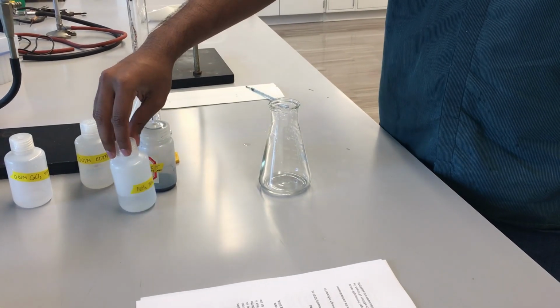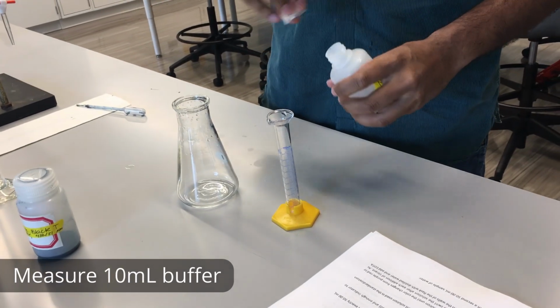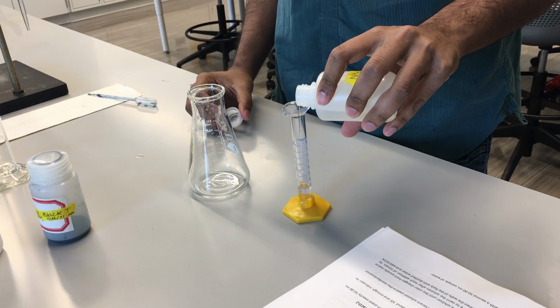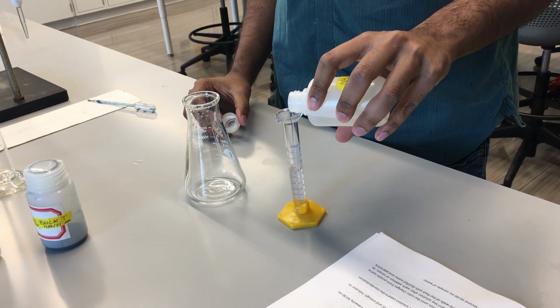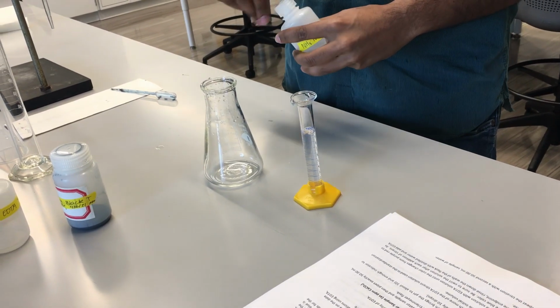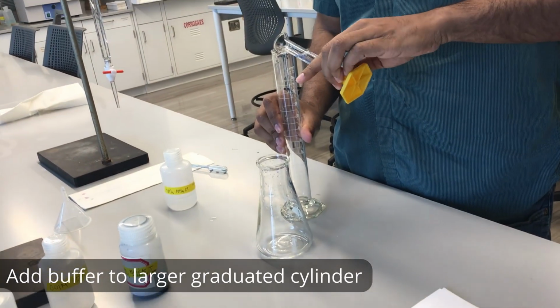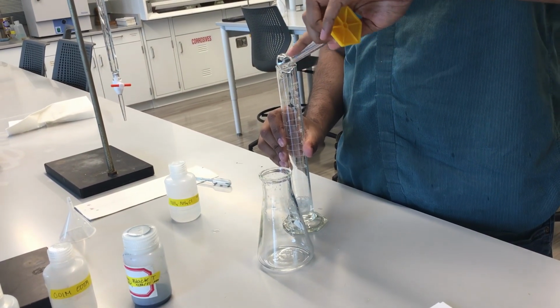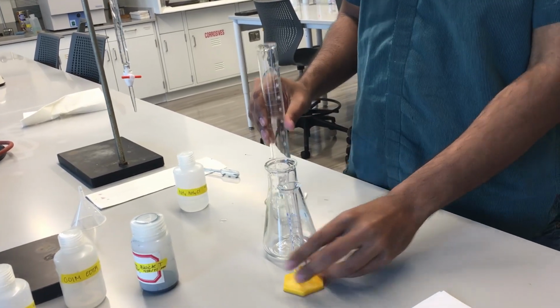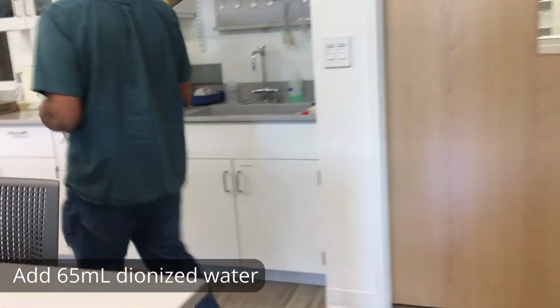Now I will go ahead and prepare the solution I'm going to titrate into. So to start off, we're going to have an ammonium chloride buffer. What this solution does is ensure the basicity, or the high pH, of our starting solution. So we'll take about 10 milliliters of that and add that to our larger graduated cylinder. This large graduated cylinder is great because it allows us to take that 10 milliliters and then add something else. What we're going to add is about 65 milliliters of deionized water.